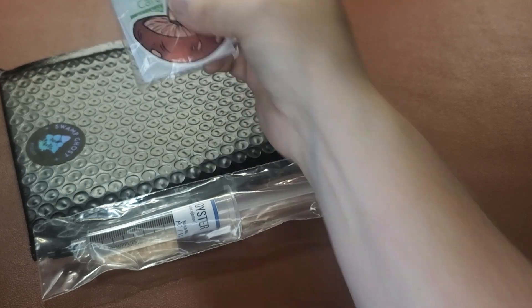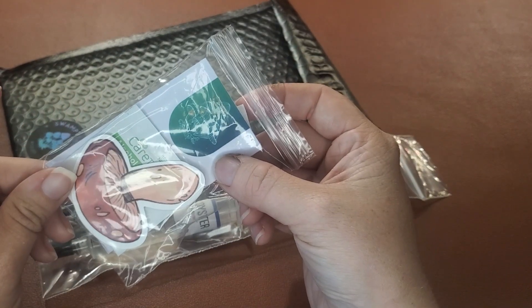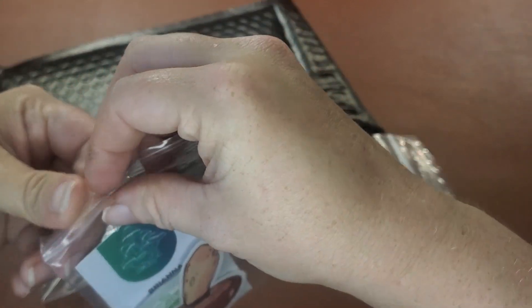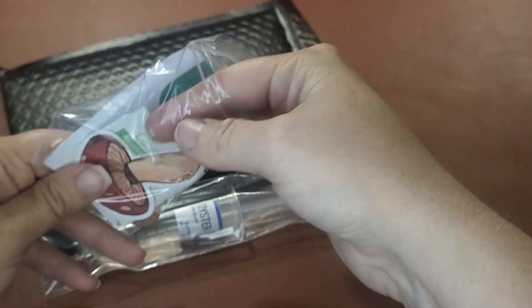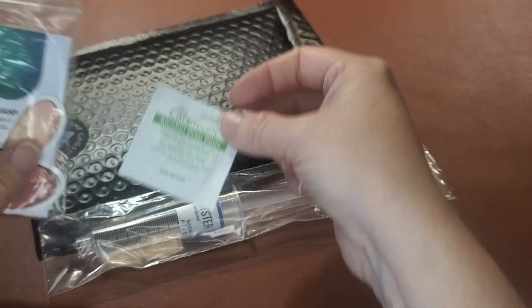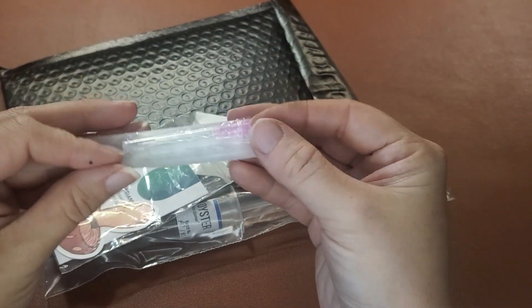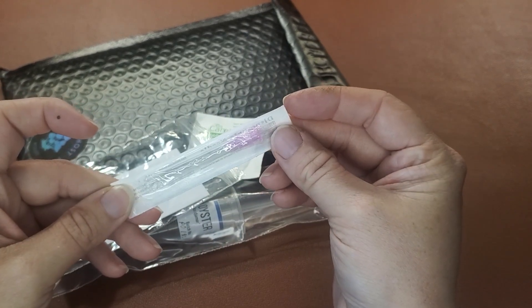You'll get this syringe and you also need to look for one of these packets — it's got a card in it, it's got a sticker in it. But also, for every syringe, you'll get an alcohol swab and one of these sterile needle packs.